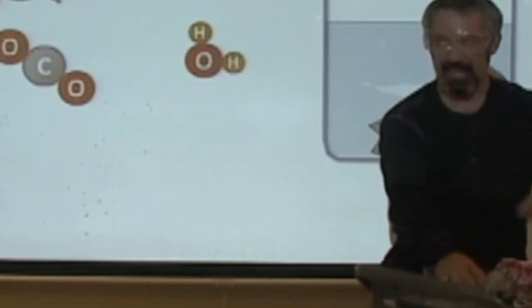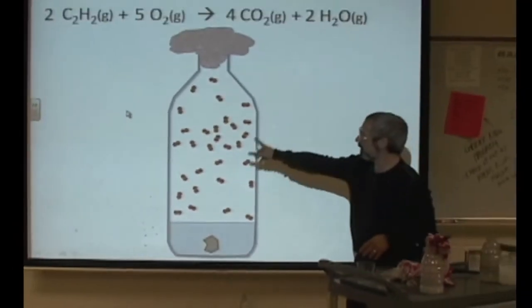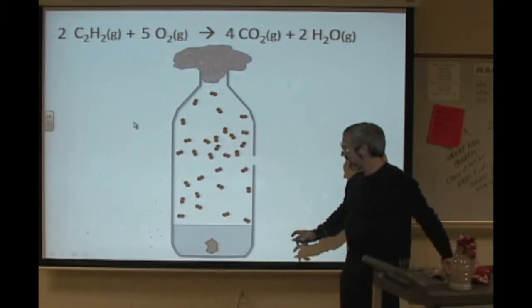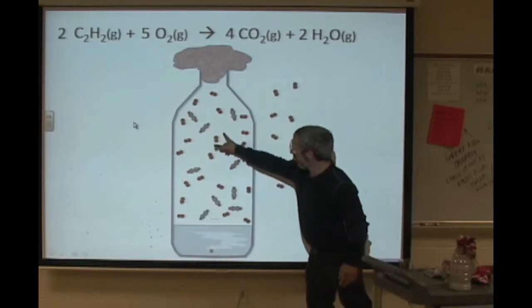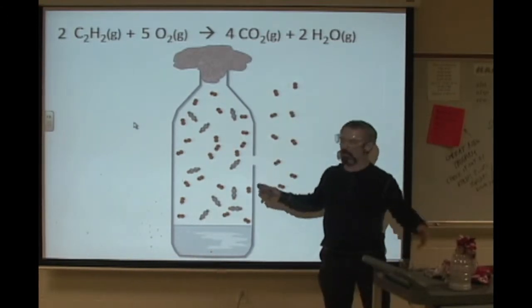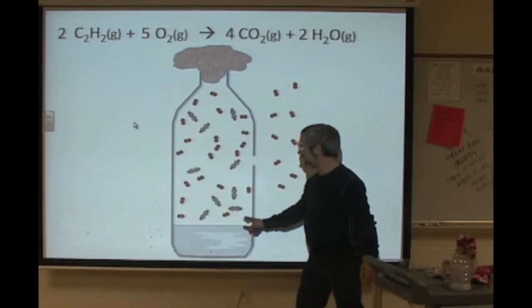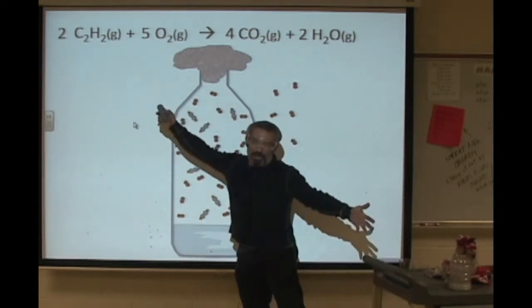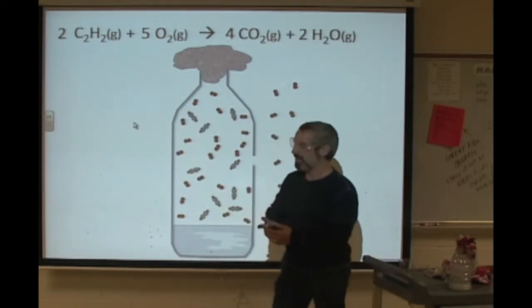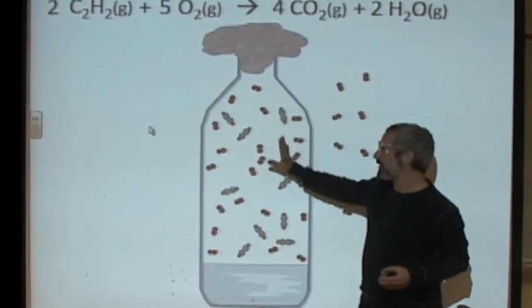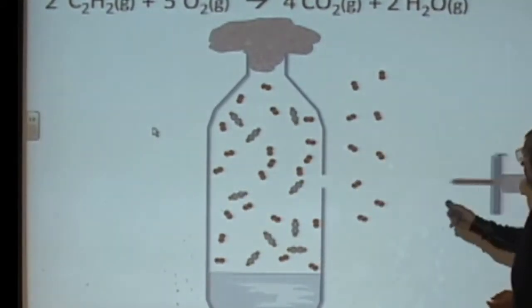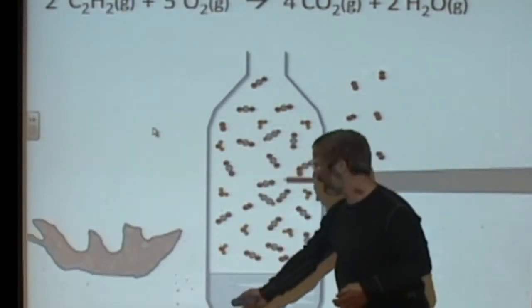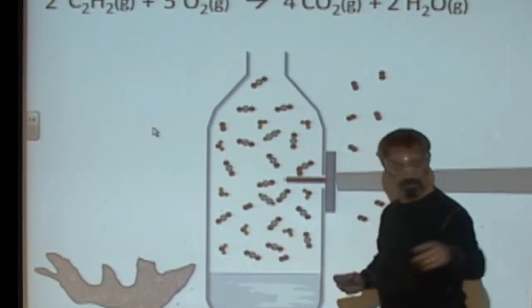Let me move this out of the way here a bit. This is our first bottle in which I just put about a half a gram of calcium carbide in there. It bubbled away, produced a good amount of acetylene, not too much. And of course, some of the oxygen gets pushed out of the way in the meantime. But look what I have left in the bottle then. A pretty good mixture of acetylene and oxygen, maybe close to the two to five ratio. It doesn't have to be exact, but this represents an explosive mixture. Something close to that ratio will give us an explosive mixture. And I brought in the sparker, pulled the trigger, boom! Down came the bandana. That was our first bottle.